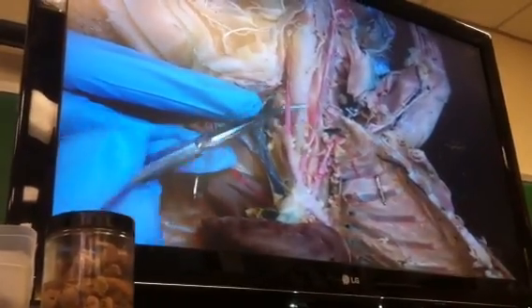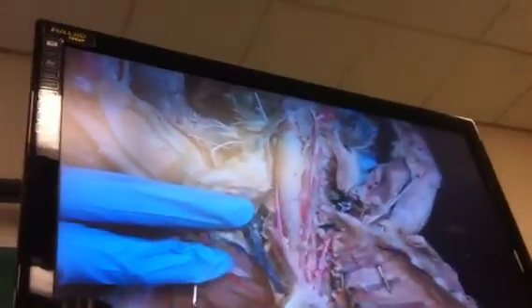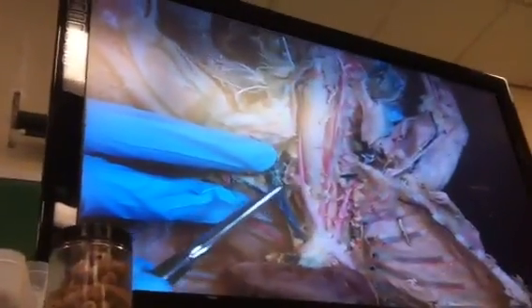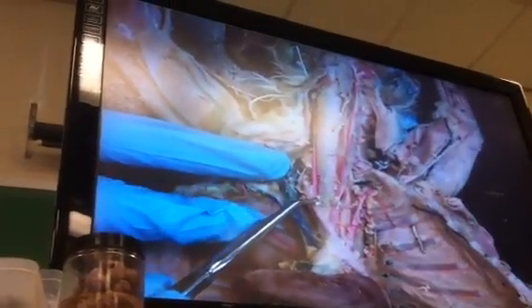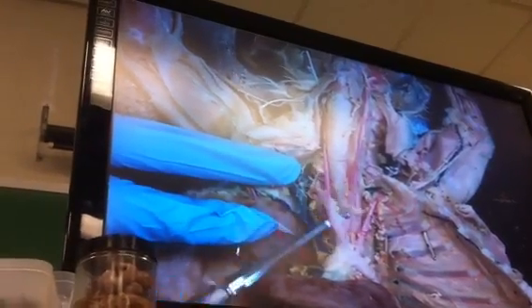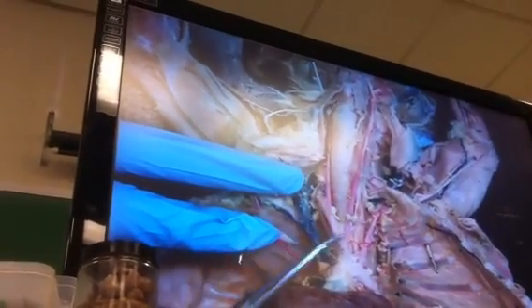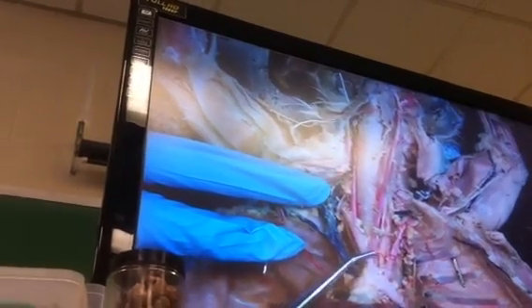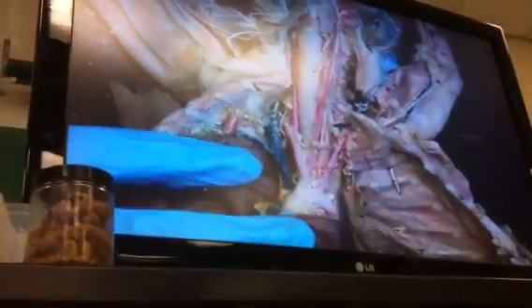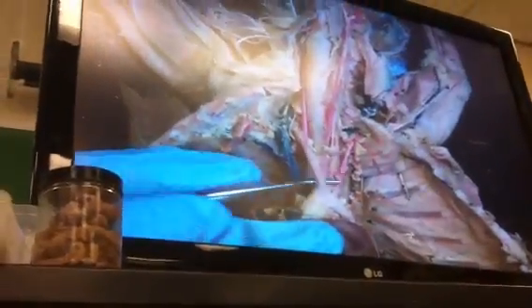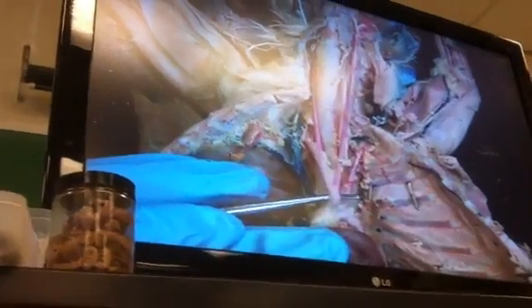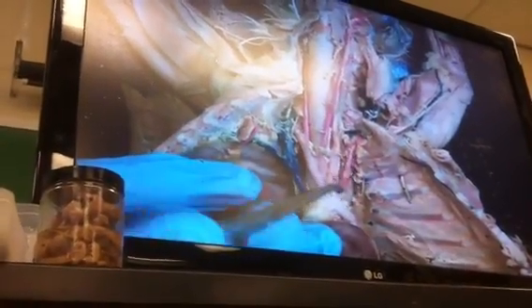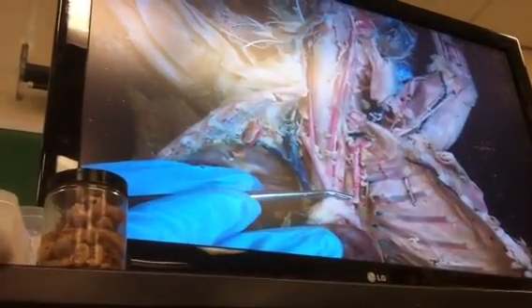What is this one going right beside the throat? That's the right common carotid, which makes this the left common carotid. Notice all three of them used to come around the same spot in cat A, but this one came off below. In addition to that, if this is the brachiocephalic artery, then this right here is the left subclavian artery.